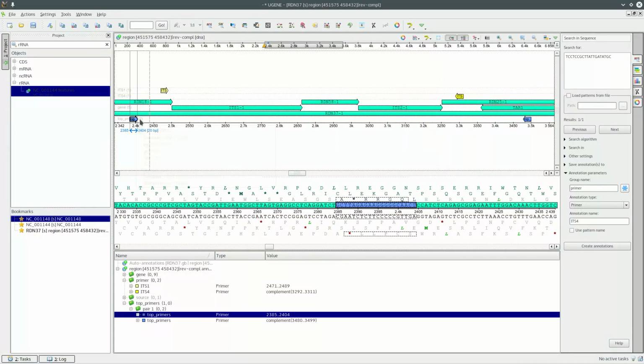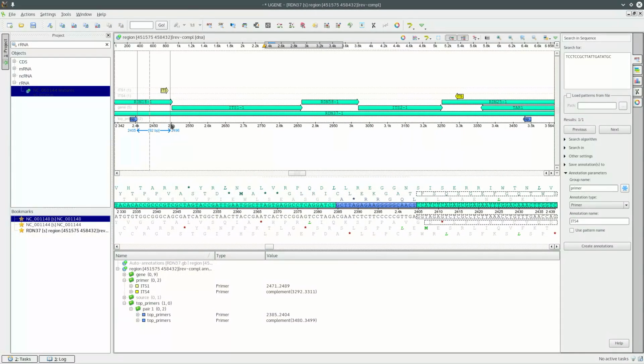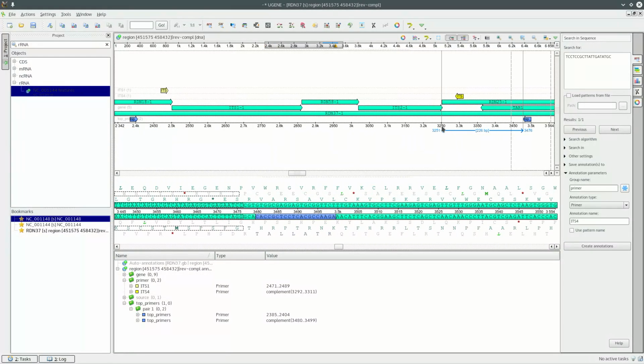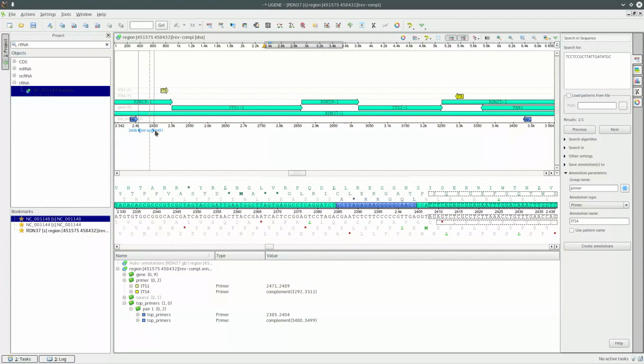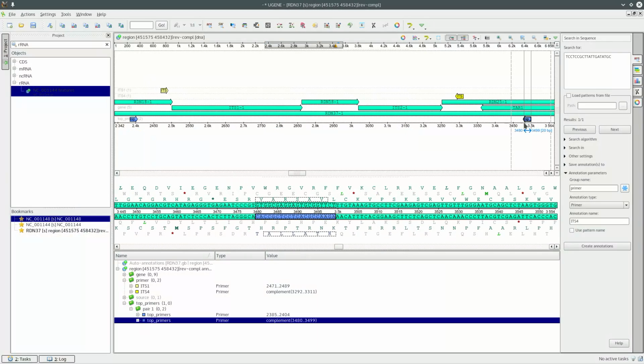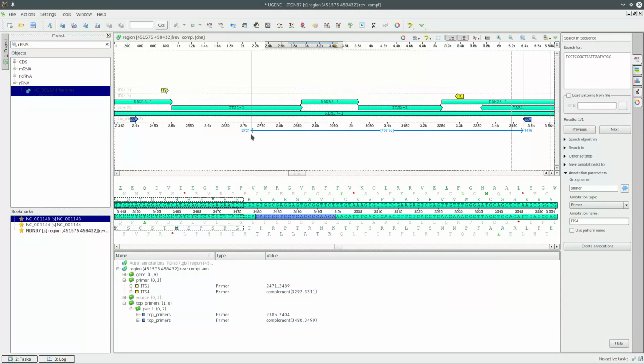Now these primers here, that Primer 3 picked for me, give us 96 base pairs of a buffer, and an even larger 226 base pair buffer from these two. So I know that I'm going to be getting high quality sequencing data when I enter the ITS regions. I also know that I'm going to get about 750 bases of reliable sequencing data from both of these primers, which means that this one will take me out to about here, and this one will take me out to about here.